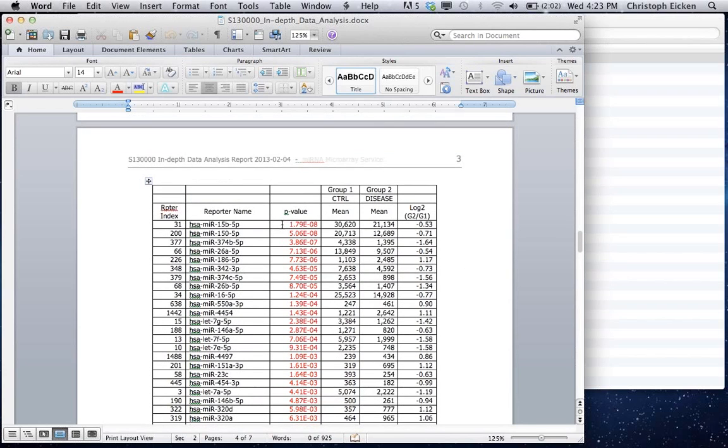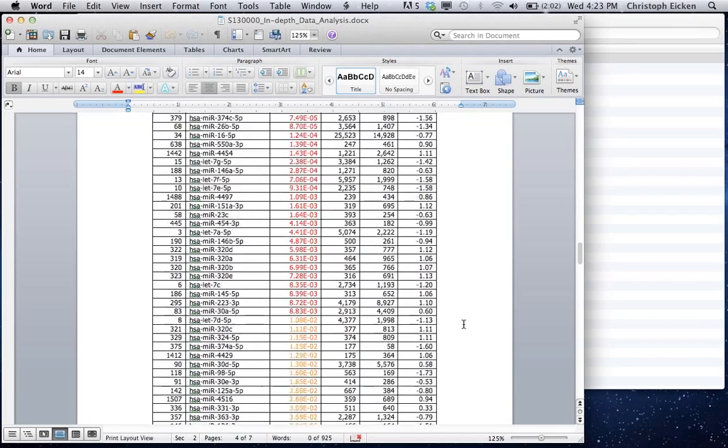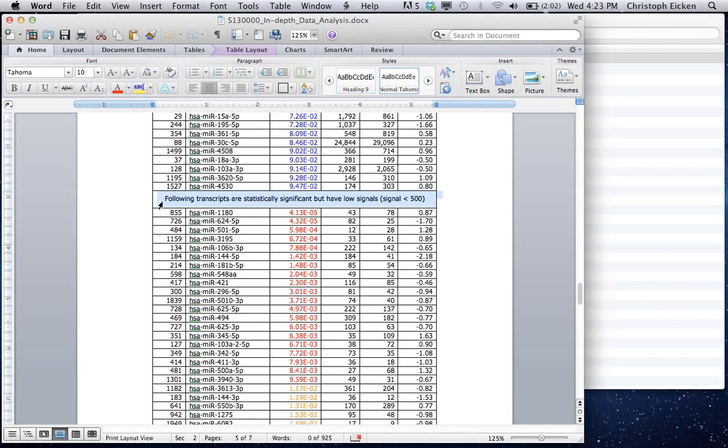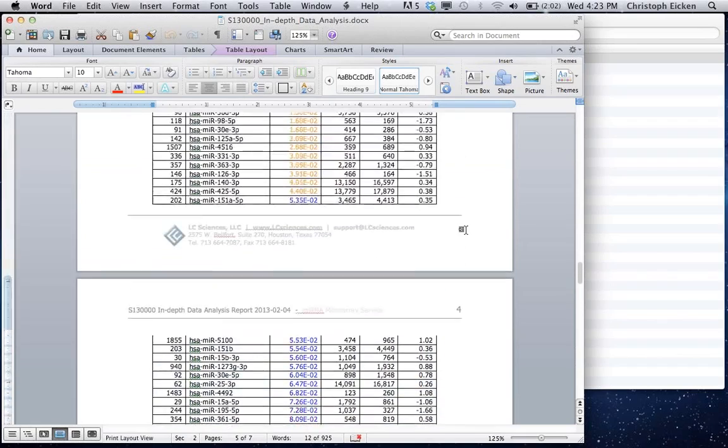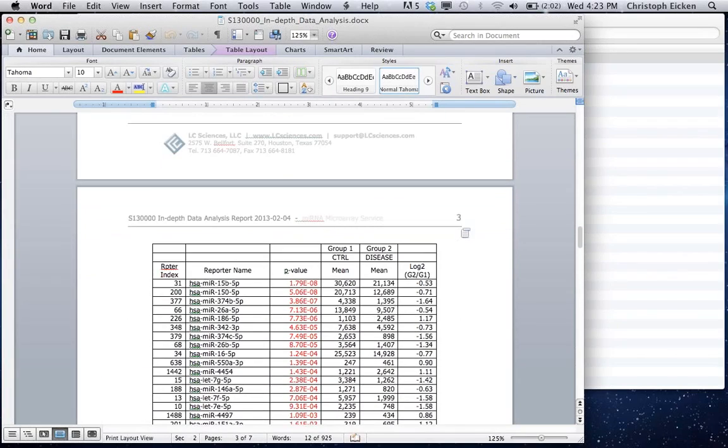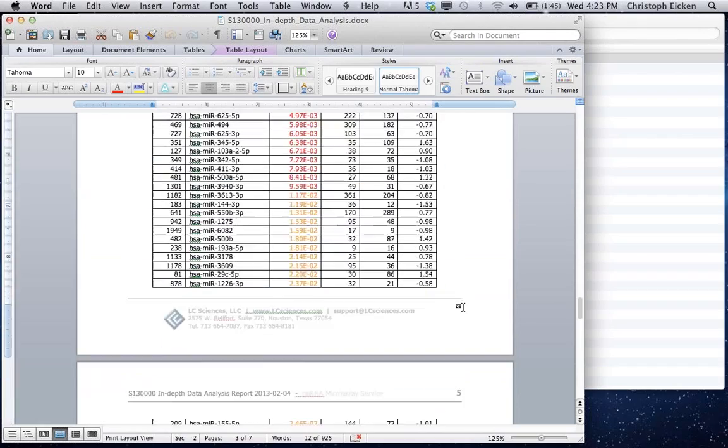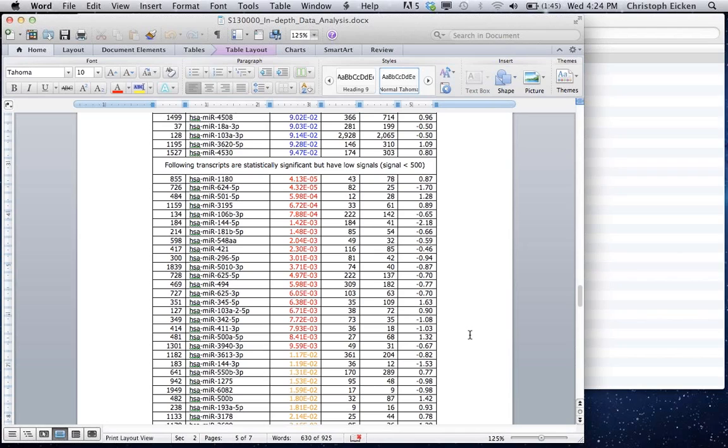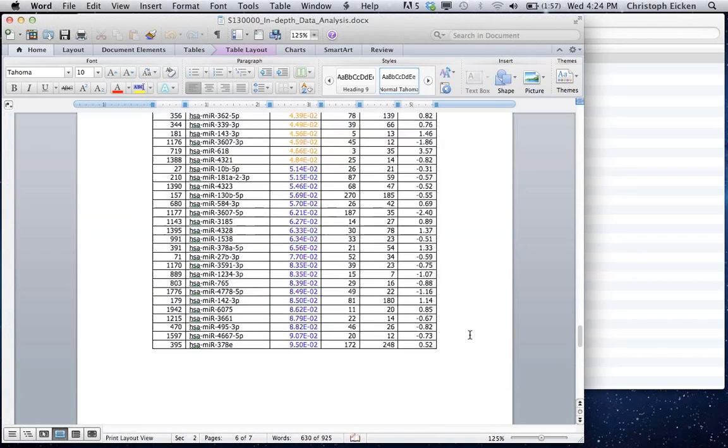So besides the p-value and the fold change, you of course want to also take a look at the overall intensity levels. We separate them here in the table already based on an intensity cutoff of 500. So if both sample groups show an intensity, the control group and the disease group would show an intensity lower than 500, we would put this below this line here. And the simple reason for that is that when you're doing qPCR validation experiments, you will find that the cycle numbers will be very, very high. And if you're looking at, let's say, a two-fold change, then the cycle numbers and associated standard deviations in the qPCR experiment would be just so high that you won't be able to detect a two-fold change. Simply because the standard deviation would be already larger than the two-fold change that you are trying to validate.